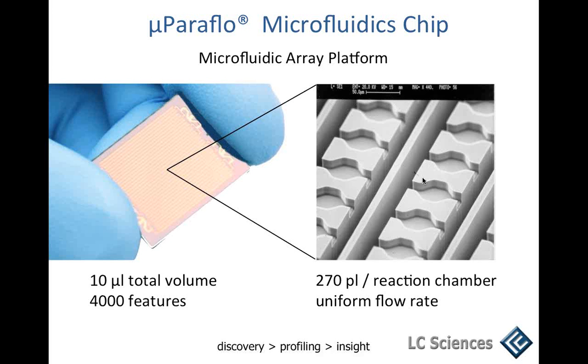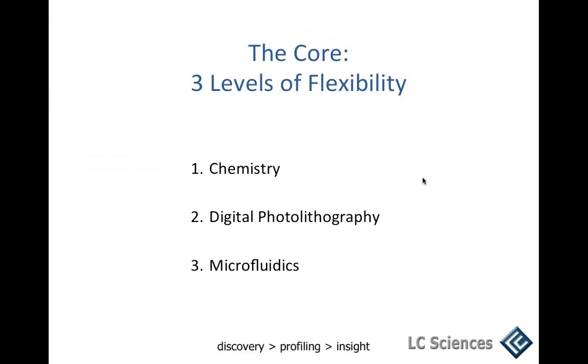So there are basically three things that allow us maximum flexibility with this platform. One point is for sure the chemistry, the way we're doing the photochemistry. The second point is the fact that we are using digital photolithography. And then the third part, of course, is that we're using microfluidics. I will touch briefly on each of these topics now.